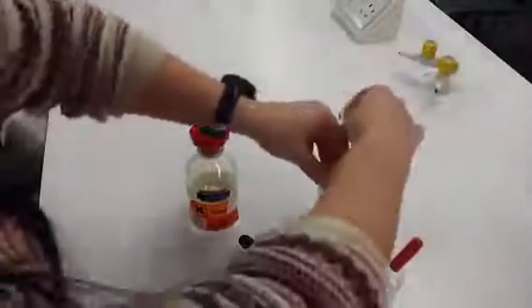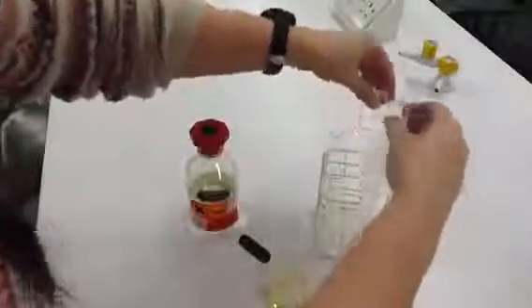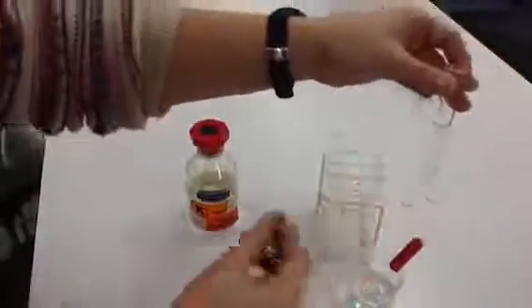So if we do the same with tube B, and observe the tube, it hasn't turned into that milky emulsion colour.